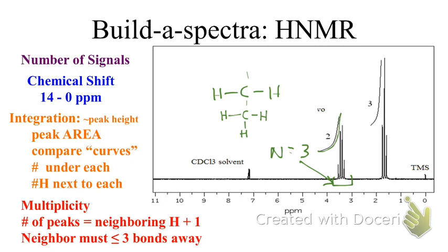What about for our other signal? What does that tell us? We still have our CH3, except each of those hydrogens has to be near 2 hydrogens. What's the easiest way to get 2 hydrogen neighbors? We already have them. We'll go next to it. So already in the same structure. So let's be careful with that statement.